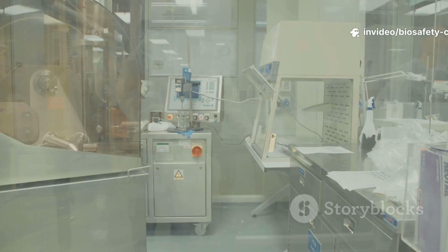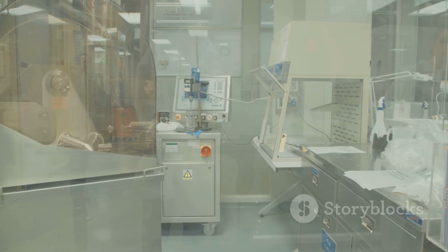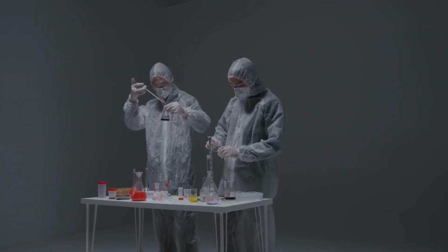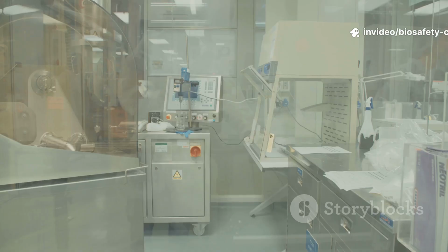Next, Class 2, the workhorse of most labs. These cabinets protect you, your samples, and the environment, using a combination of inflow and downflow air. Class 2 cabinets are divided into 4 subclasses: A1, A2, B1, and B2. Let's break them down.